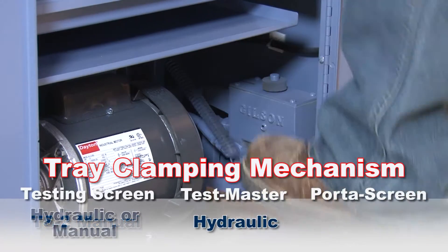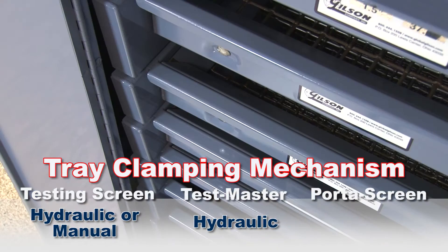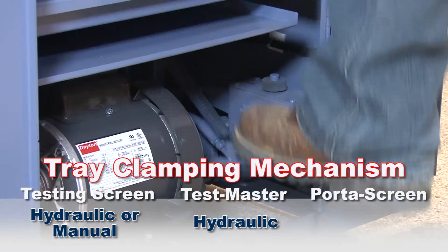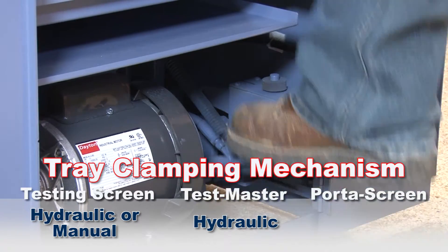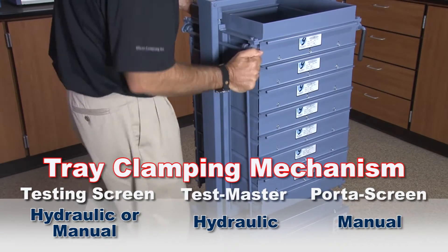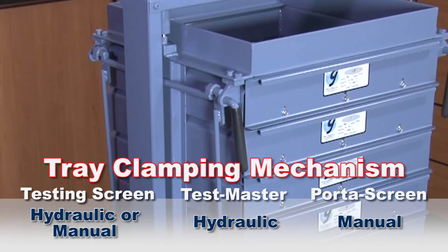The TM5 and TM6 models have a conveniently located foot-operated pedal that easily and quickly activates the hydraulic clamping and releasing system. And the TS3 and PS4 screen trays are quickly secured using the easy-to-use clamp levers.